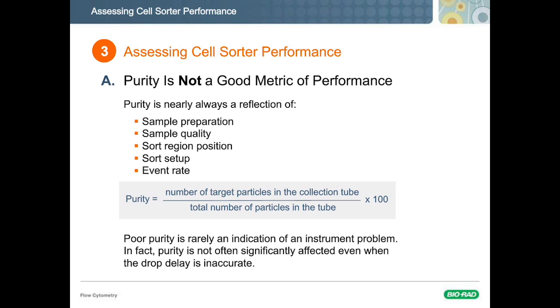But a lot of people jump right to purity, and I always try to get people to back up a little bit from that, because when you're seeing purity issues, a lot of the time you need to look at the sample before you go to the instrument. Or you can verify the drop delay and then go back to the sample, but usually it's sample related.